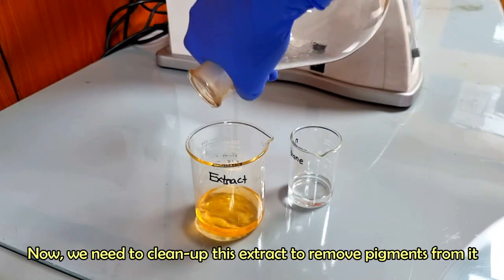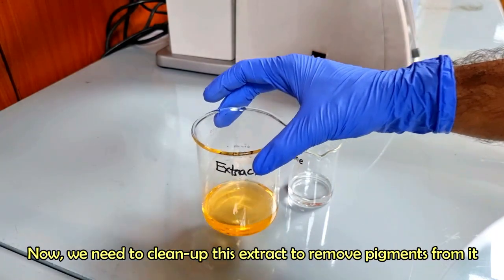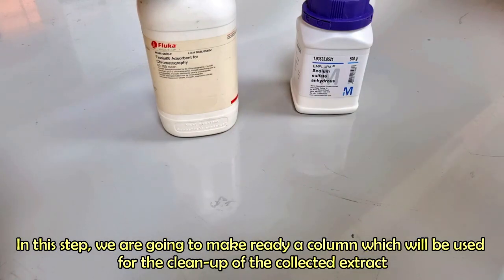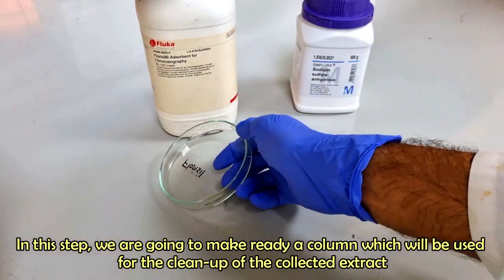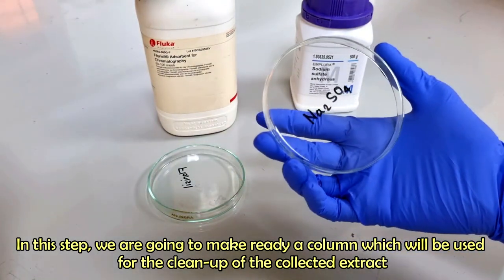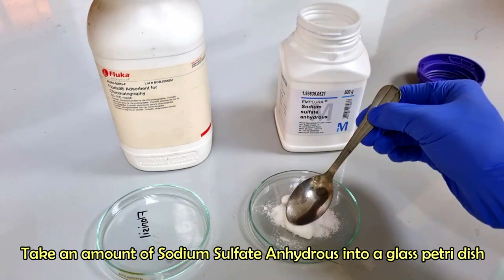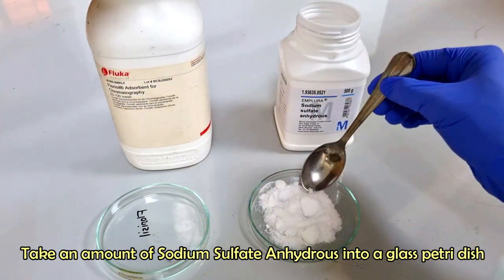In the next step, we will use the USEPA 3620C Florisil method for the cleanup of the sample extract. In this step, we will prepare a column for the cleanup of the collected extract. Take an amount of sodium sulfate anhydrous in another glass dish.